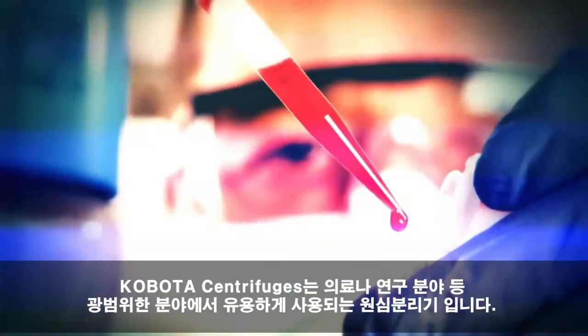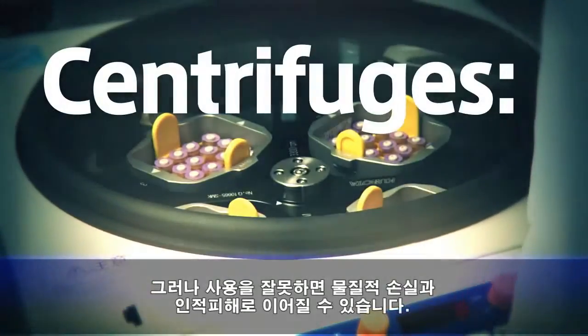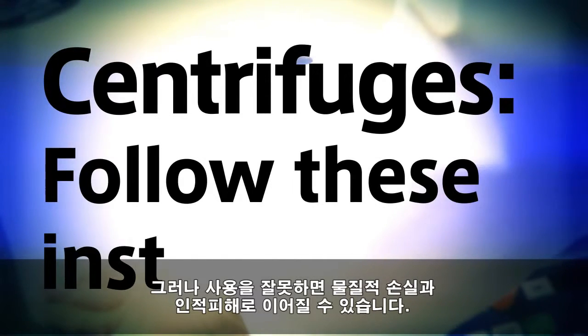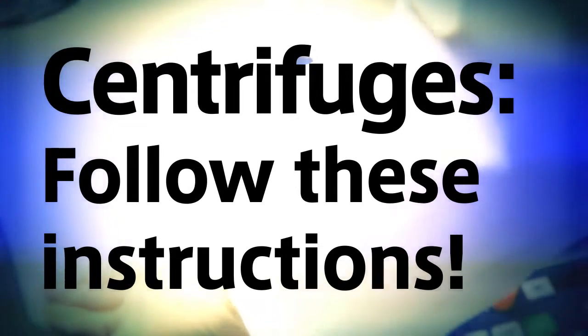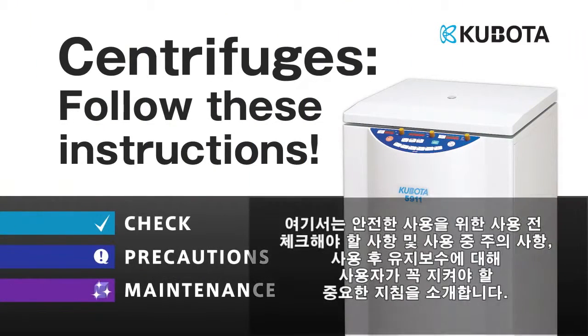Centrifuges are useful for a wide variety of fields, from medicine to science. However, if used improperly, centrifuges could cause property damage and even loss of life. Here we will explain important instructions for you to follow so that you can use your centrifuge safely.